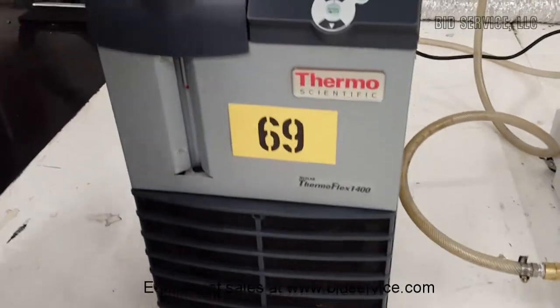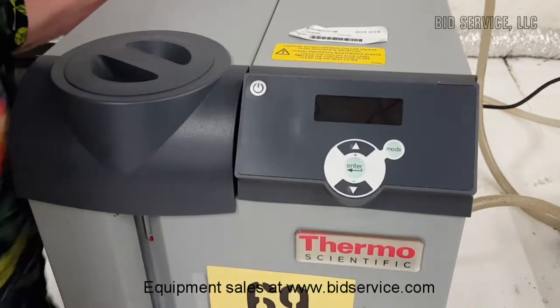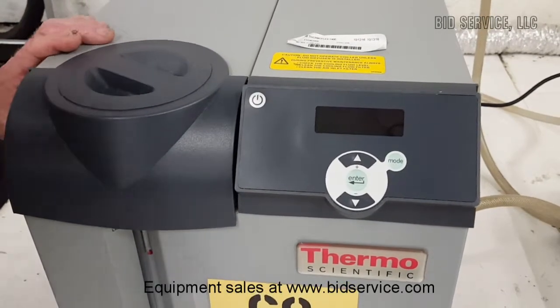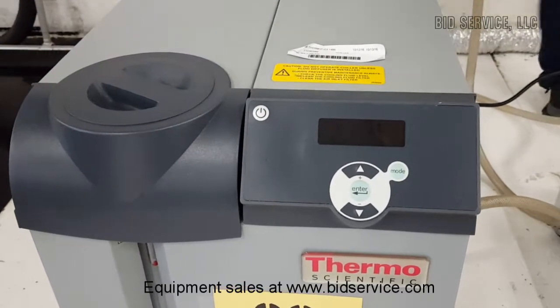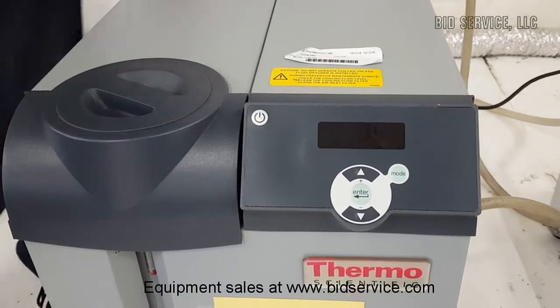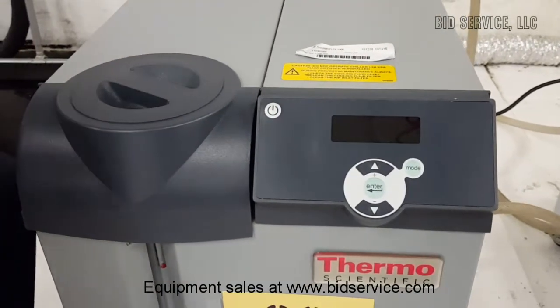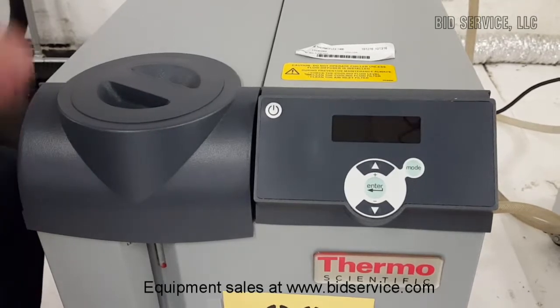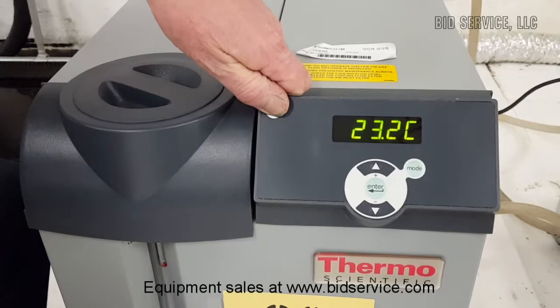Turning it on, we have one power switch in the back. Once the main breaker has been thrown, you can push the power switch right here.